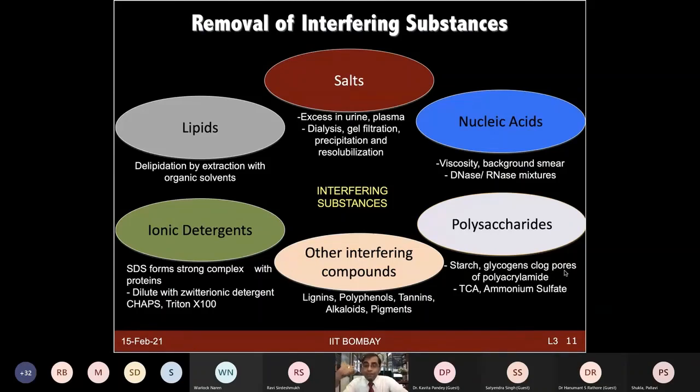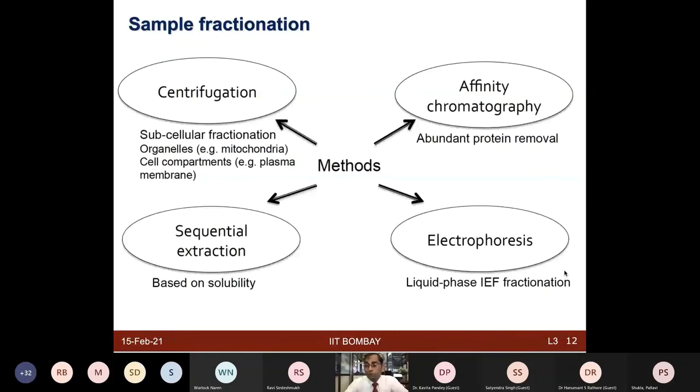And as a result, you are going to lose your less abundant proteins. So if you can avoid those contaminations, then I think your sample preparation is going to be really good, and you can make use of that for your further mass spec or other proteomics experiments. Now, given that what we are talking about is highly complex samples, which have thousands of proteins to investigate.